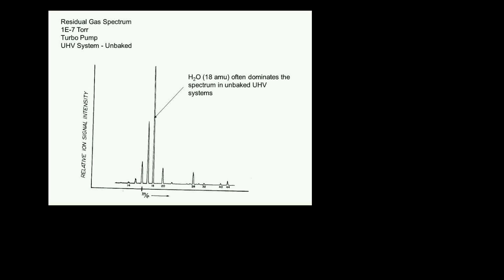So I cannot emphasize how important it is to have an RGA in a vacuum system where you rely on hitting target pressures every day. If this were my vacuum system, every day I would bake it out overnight. I would come in the morning, turn on the RGA and look at what my signal looks like. If my total pressure hasn't achieved its target pressure, and I look at the spectrum, and even if I don't know that it's perfectly calibrated, it is completely dominated by water, I know for sure that the only way I'm going to achieve the target pressure is by baking it out.